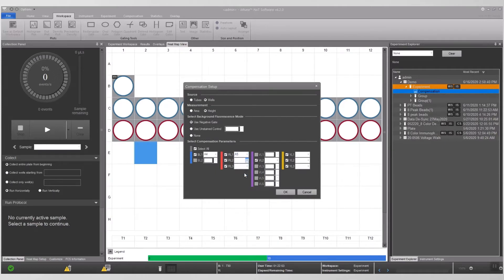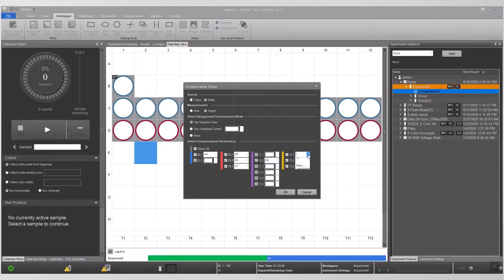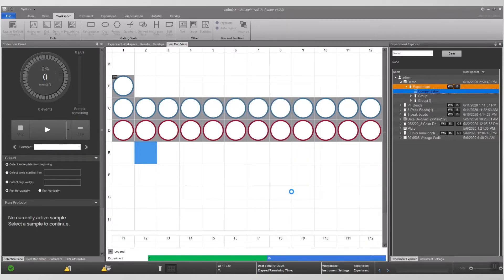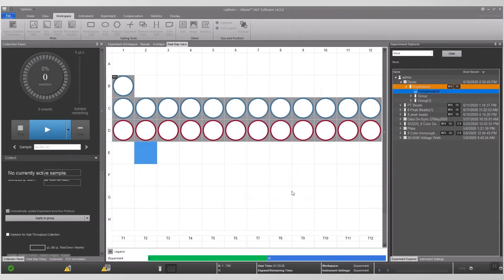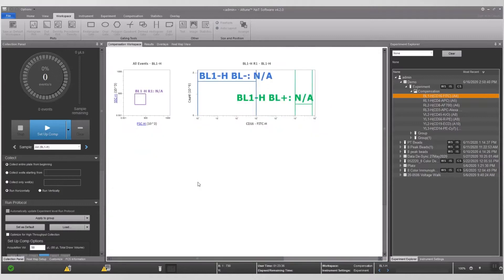Tubes can be used instead of wells if the user feels more comfortable. When finished, click OK. The selected wells will appear in the heat map view where the single controls are. The upper corner of the well has a CS on it. To open up the workspace, click on compensation workspace and the plot will appear.